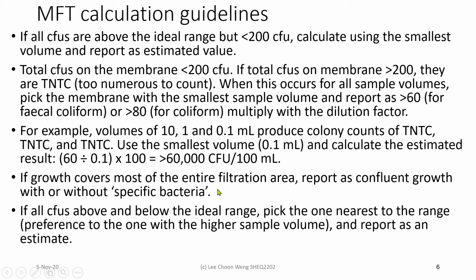If growth covers most of the entire filtration area, you can report as confluent growth, either with or without the specific bacteria. So if you are looking for coliform and you see coliform, but then most of the other growths cover the entire filtration area, you can report confluent growth with coliform. So probably if this occurs, you will have to request another sample or repeat the test.